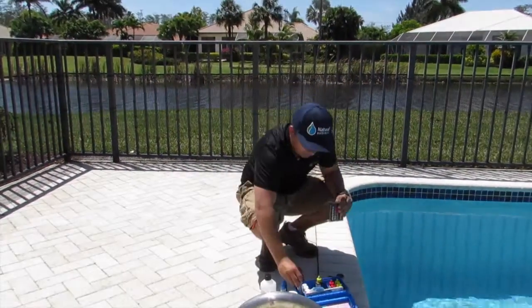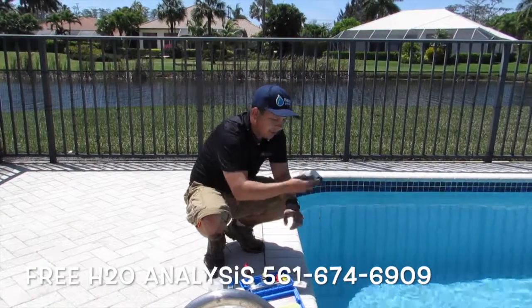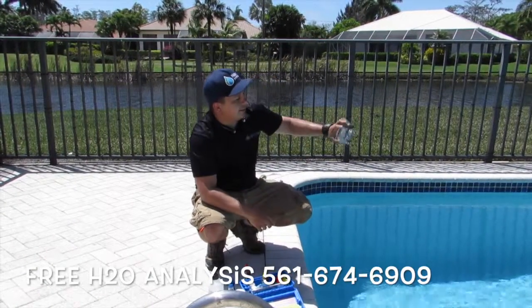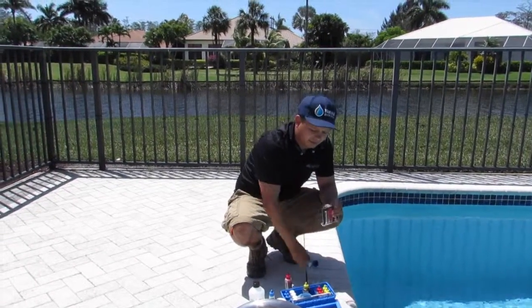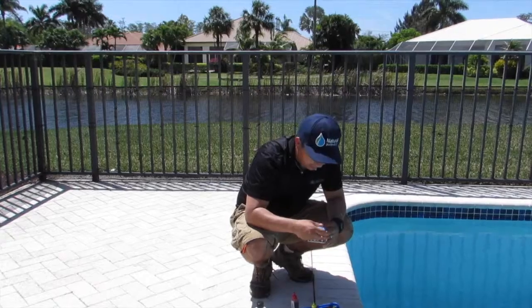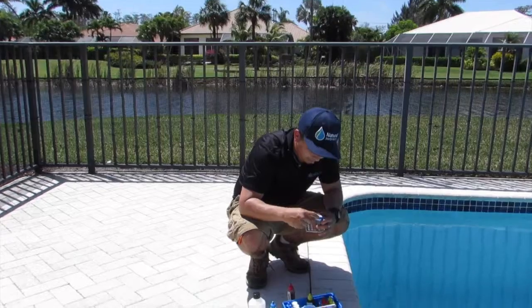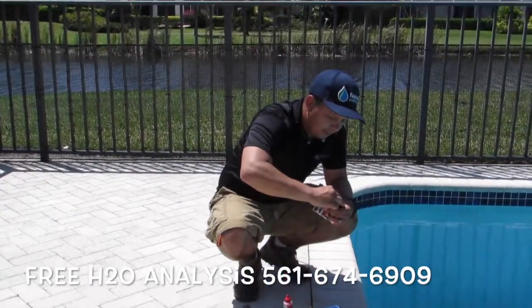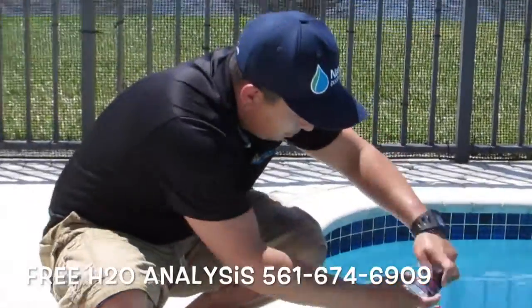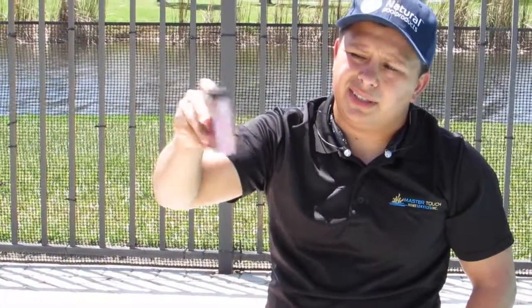Close the bottom, put it back, get the cap, and shake it — it doesn't turn anything right now. Once we throw in the R11, 5 drops. We're going to shake it. As you can see, the water turns into like a pinkish color, maybe purple.